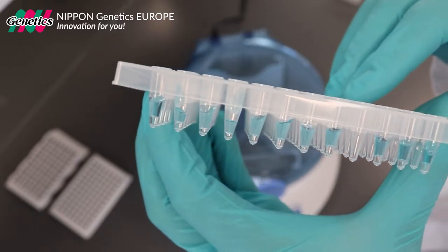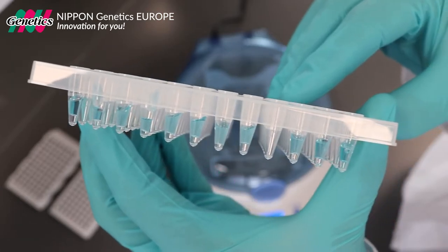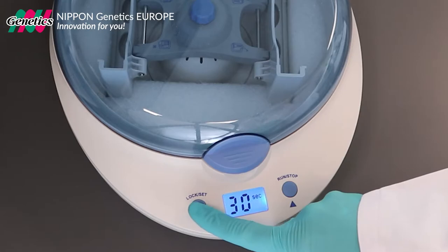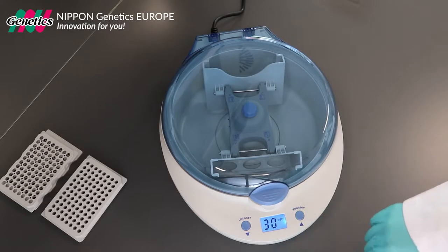Centrifuge your plates to get the reaction volume to the bottom of each well without any droplets on the wall side. Press the lock set button to open the lid.